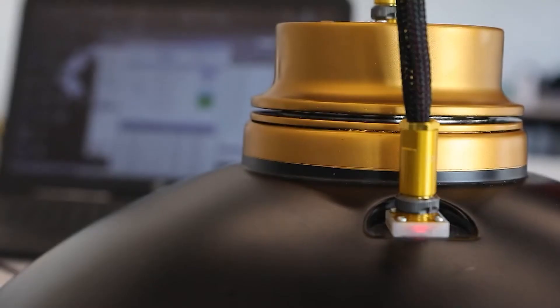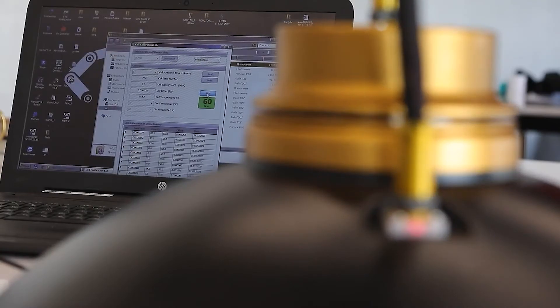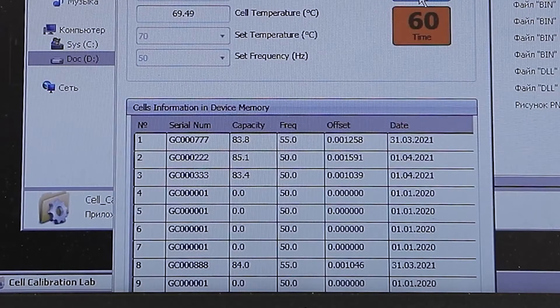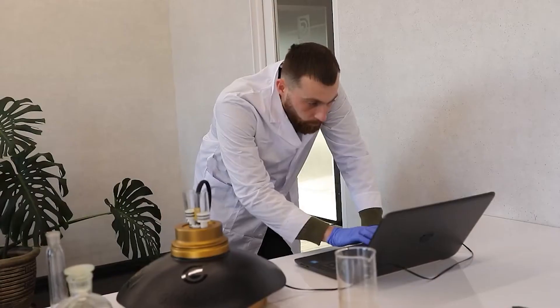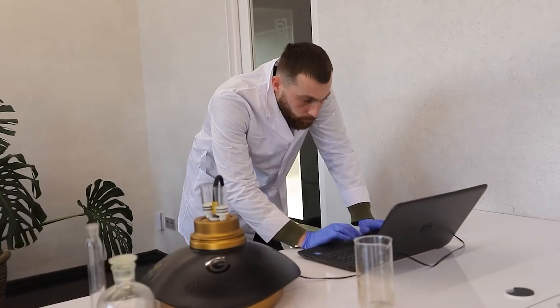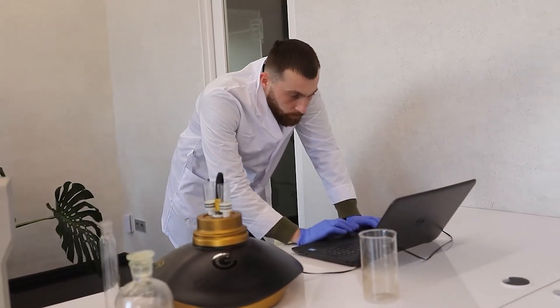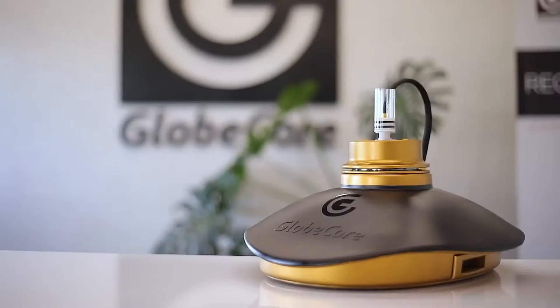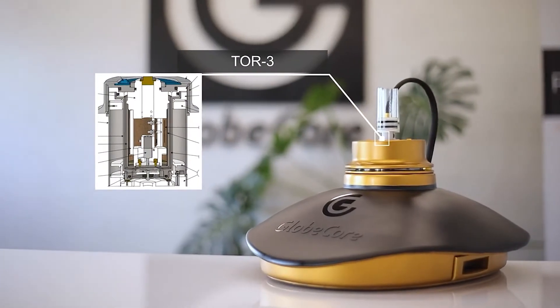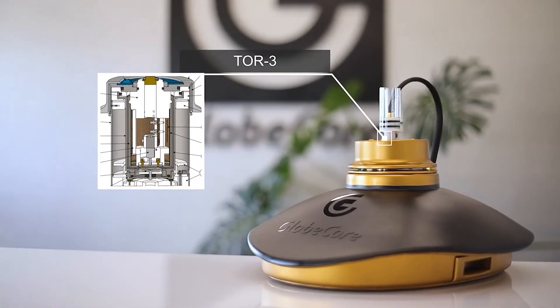As well as preliminary calibration of an empty measuring cell using special software. This software facilitates calibration and results storage for 10 different cells. All cells are interchangeable, so they can be used on one device without recalibration, which would be required when using one cell for all measurements.